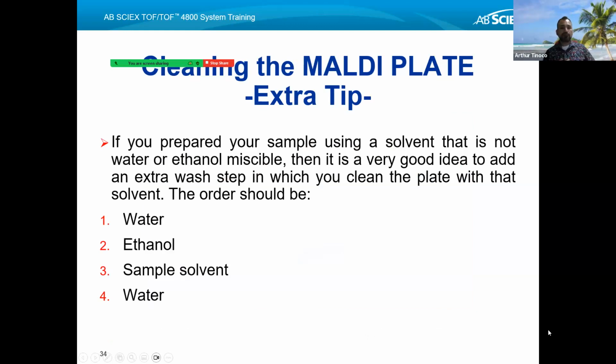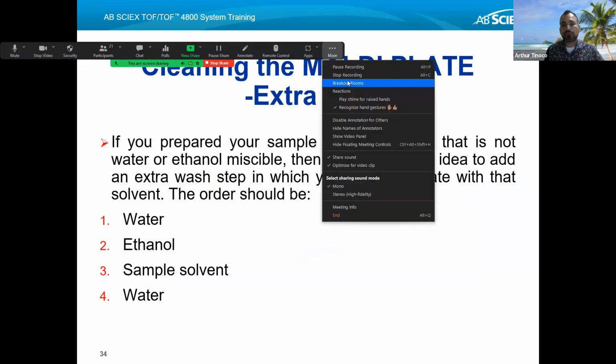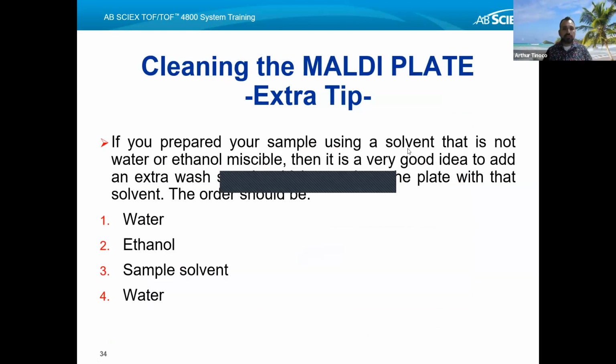All right, so there's a few extra things I want to note to you about cleaning the plate itself. Typically I will use water and ethanol for the process of cleaning the plate. You can substitute the ethanol with methanol or isopropanol. But if you have ethanol, that's one that I would suggest to use.